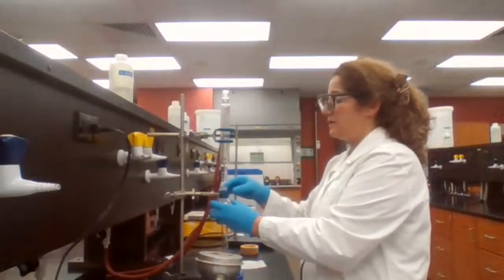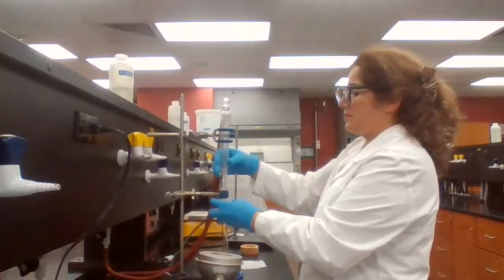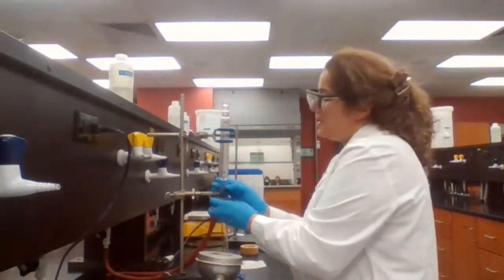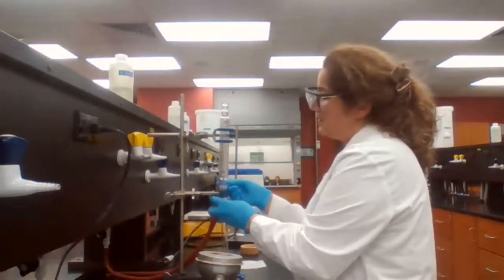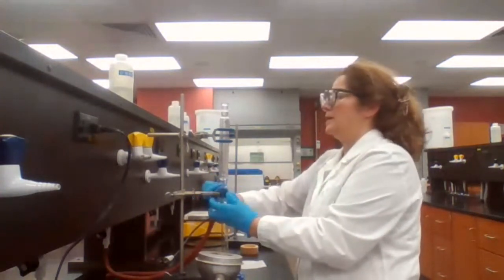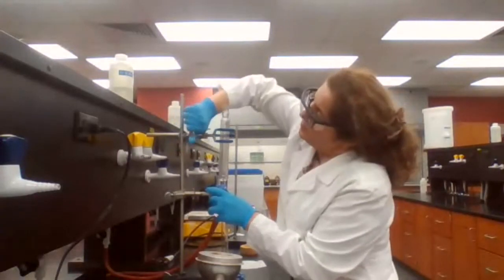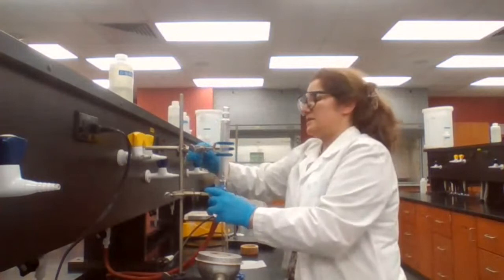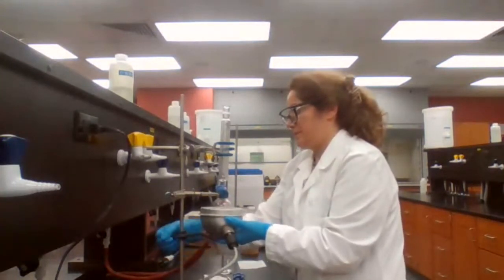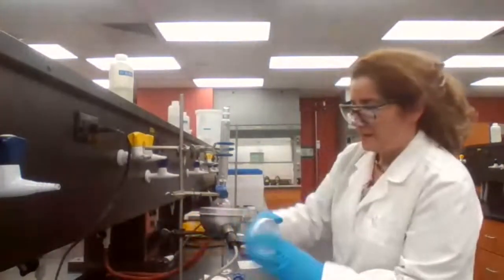So we add boiling chips. And now we're going to start the setup. I already greased the glass joints. I'm going to use the clamp to hold the two glass pieces together. In the center and everything fixed. Bring the heating mantle up.